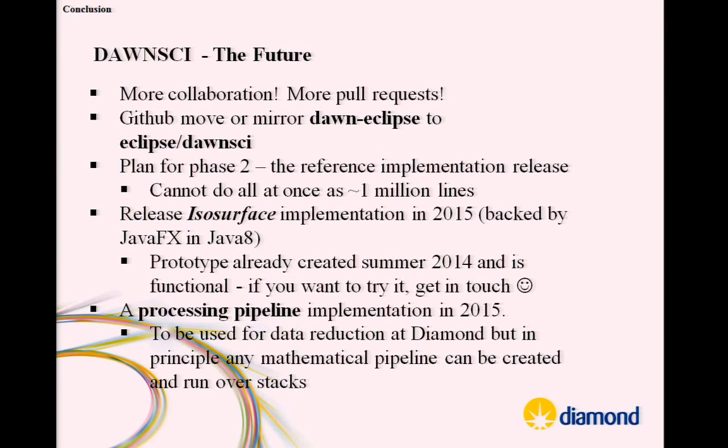So on to the future. Thanks. We had 2 pull requests last week, so thanks for that. And hopefully we'll get some more, and that can be a way of moving forward. We're not trying to dictate what this should be. What we're trying to do is suggest a way of describing data within Eclipse and manipulating it, and we very much like to get input on the correct design. And it might be then that we change our implementation to fit with that design, and then more people will be able to do this kind of stuff.